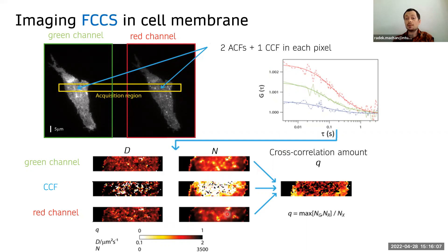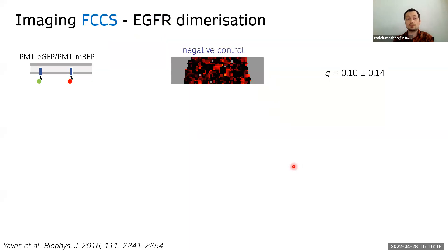particle number maps. And from the particle number maps, we can get cross correlation amount map, which is a measure of how much are the signals cross correlated in that pixel.